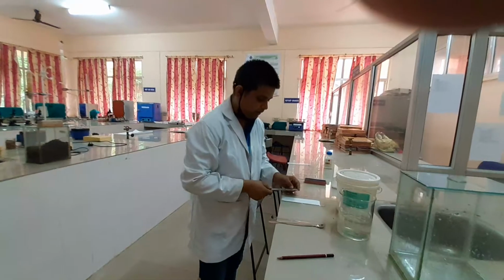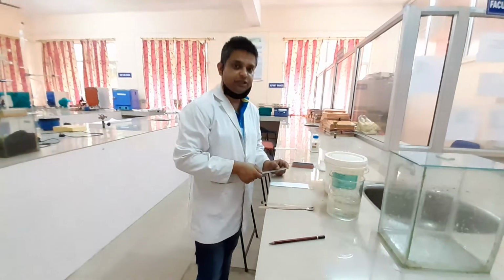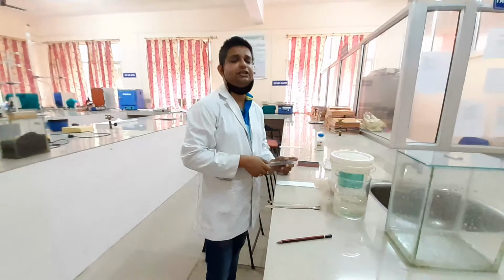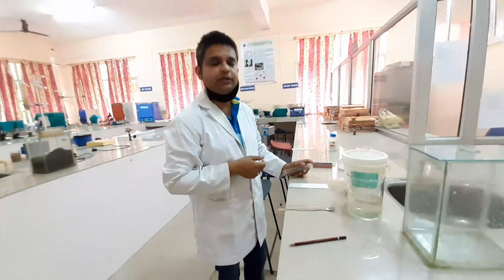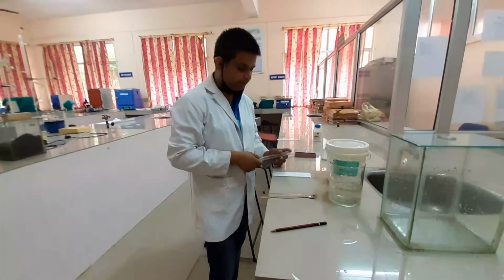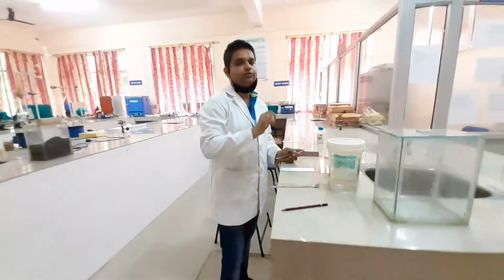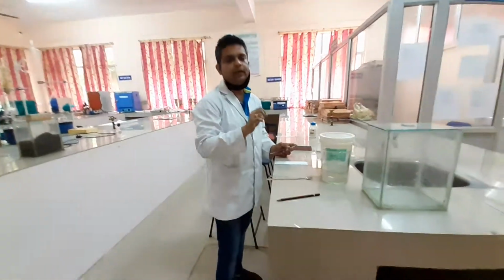Now the calculation of the Rf value. Rf value means the retention factor. Rf value is calculated by the distance travelled by the solute front divided by the distance travelled by the solvent front. Now the solvent front we already measured, it is 10 centimeter. So in the denominator it will always be 10.